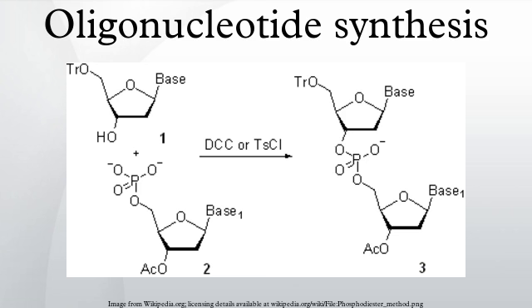2. The second approach is only used when the intended method of purification is reverse phase HPLC. In this case, the 5'-terminal DMT group that serves as a hydrophobic handle for purification is kept on at the end of the synthesis. The oligonucleotide is deprotected under basic conditions as described above and, upon evaporation, is purified by reverse phase HPLC.